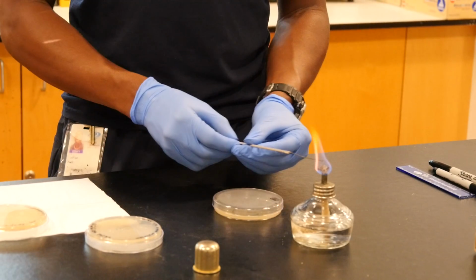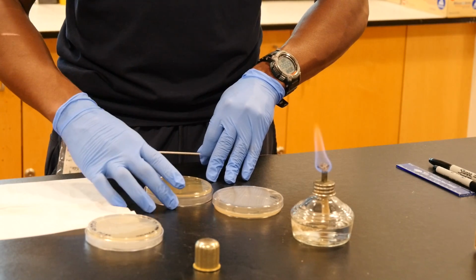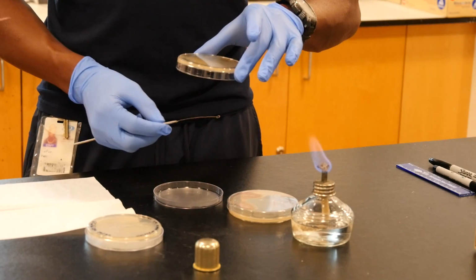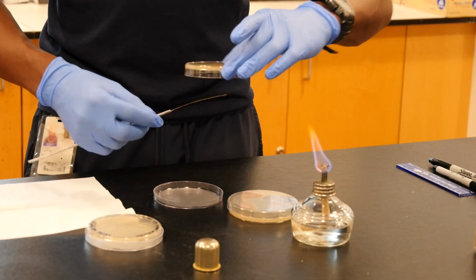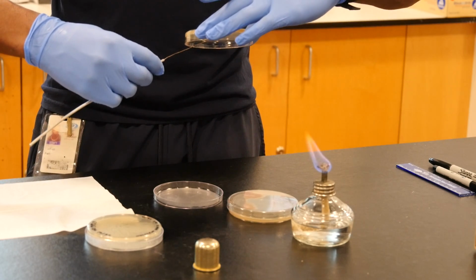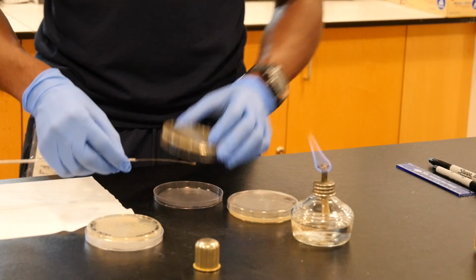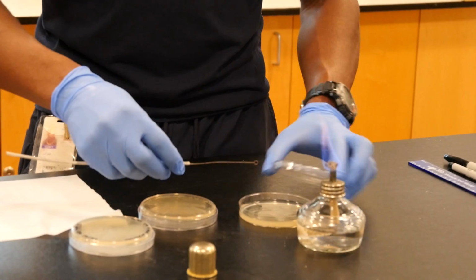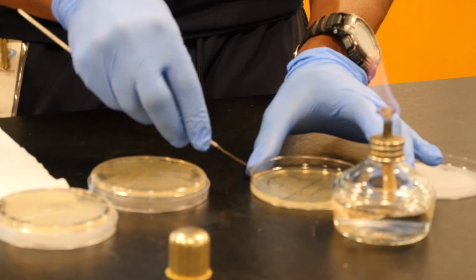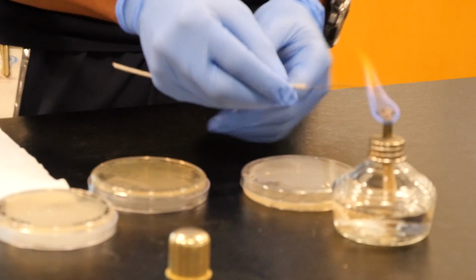Get my other inoculant loop. Let it cool off. Check my culture, and the culture I'm using now is Enterobacter. Look for a good streak. Enterobacter is letter D. I'm checking the loop and making sure that it's not hot. No sizzling sound. I'm going to grab my streak. Oh, that's not good enough. I'm going to do it one more time. There we go. And again, I'm going to streak, length and width of the letter. Burn my inoculant loop.